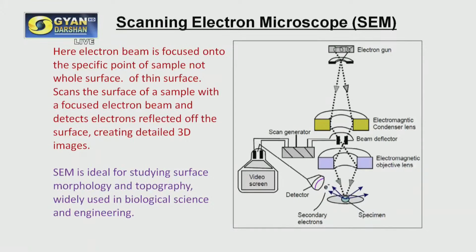And we can study living and non-living cells in the light microscope, but in electron microscopy we can only see the object in a dead state, because electrons kill the living organism if we observe it under the electron microscope. So now, another microscope, the advanced level of the electron microscope, is the scanning electron microscope.